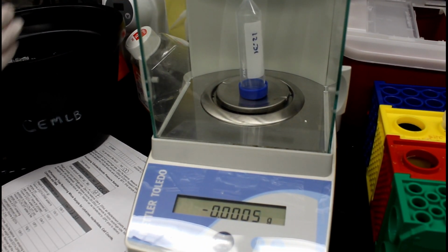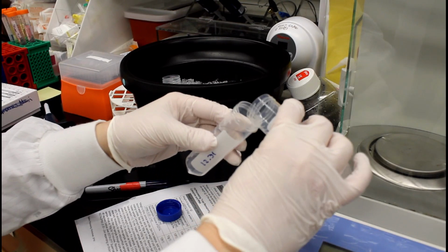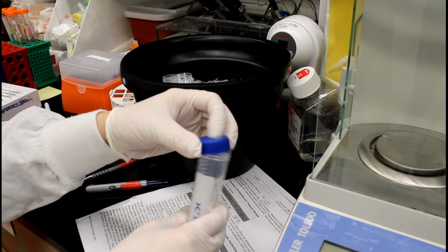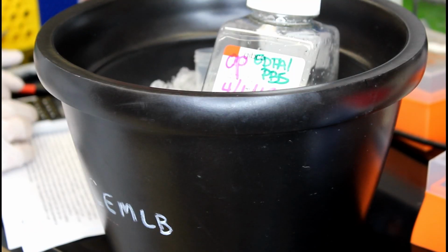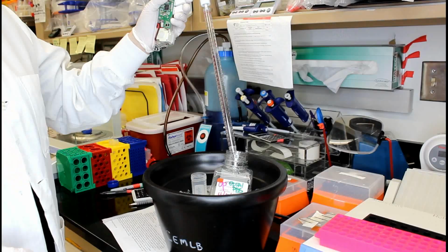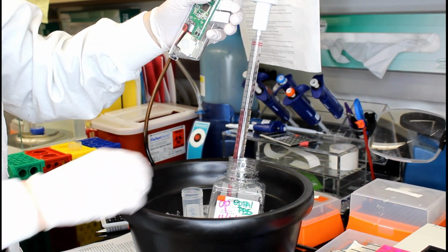Next, add the remaining sample to the 50 ml conical test tube and record its weight on the tube. Next, add 8 times the sample weight of cold EDTA DPBS buffer solution to the sample.